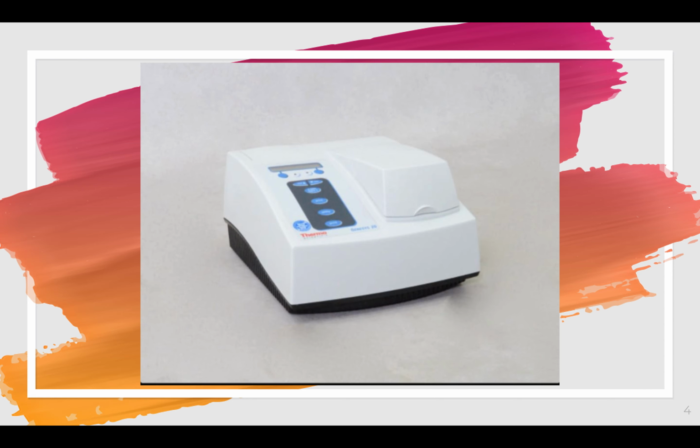spectrophotometer anymore. So this is the reason why we have to discuss the principle and even the different components of your spectrophotometer. Again, why? Because in the actual scenario, what you're going to see is already a spectrophotometer built inside your automated machine. Okay, so let's move on.